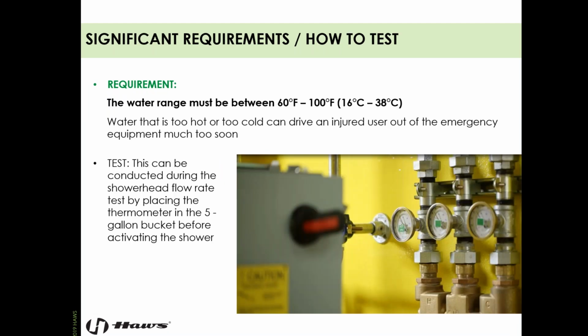Now the water range, again, 60 to 100 degrees Fahrenheit, 16 degrees Celsius to 38 degrees Celsius for my buddies up north. Water that is too hot or too cold, again, is going to drive the user out of the equipment. We here at Haws have heard terrible stories of coworkers having to force people into the equipment to get this material off, or even first responders having to do so, because it's intolerable.